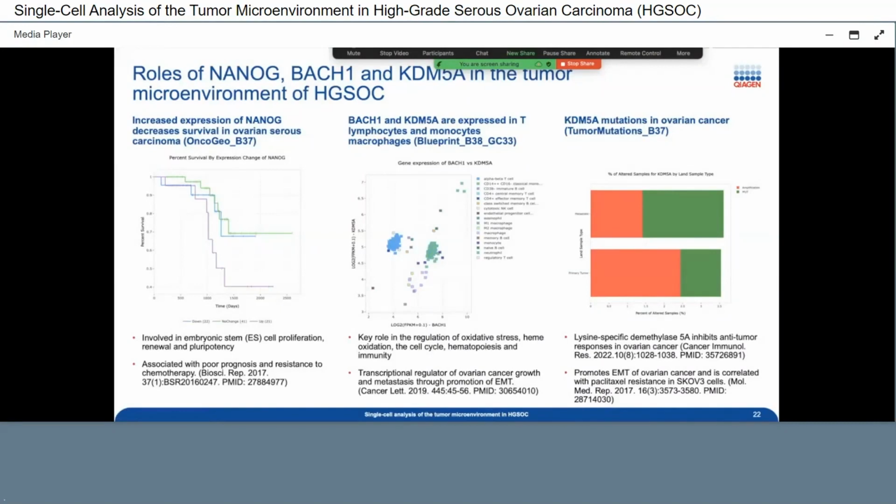That has been accessible in Land Explorer, which is the web version that we can get a direct link to from IPA Gene View. So this is external data, and that's the beauty of it, because now it's unrelated to my own comparison expression and gives real information in cancer situations, in T-cell situations, or what is the tumor that we have in those particular genes. So very external, very useful.